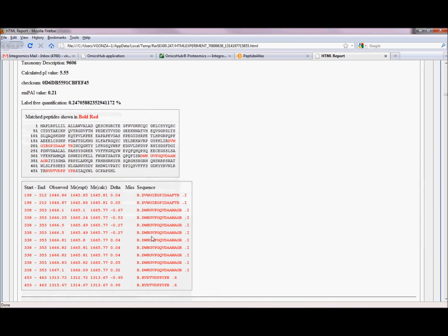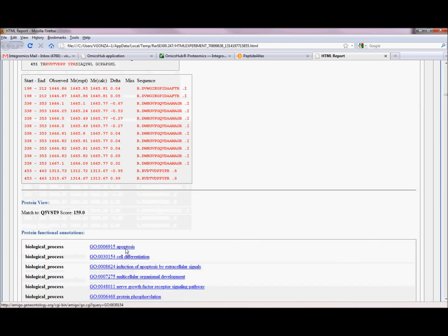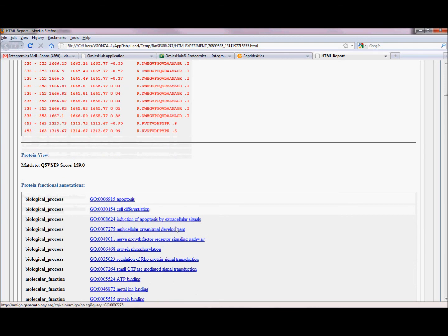Okay, so this is pretty much what I wanted to show you about OmicsHub Proteomics.